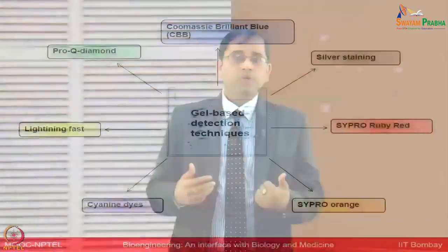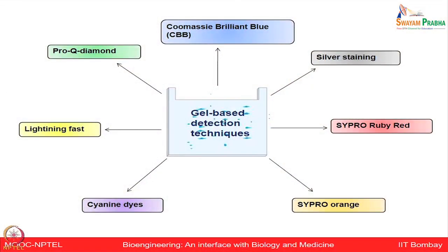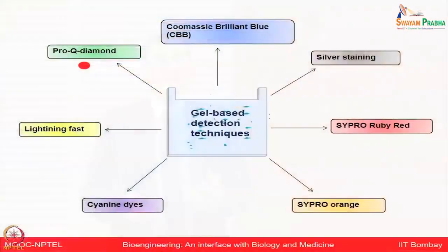So far, everything you are doing is on a transparent gel. You have literally no idea what can be seen on those gels and what you have separated, unless you add some staining reagents which can visualize the gels. Therefore, different types of staining reagents become very important. The most commonly used staining reagent is Coomassie Brilliant Blue, but you can also use silver staining, or different sensitive dyes like SYPRO Ruby. If you are looking at modifications at the PTM level, you can use Pro-Q Diamond, or for very sensitive detection, you can use cyanine dyes.